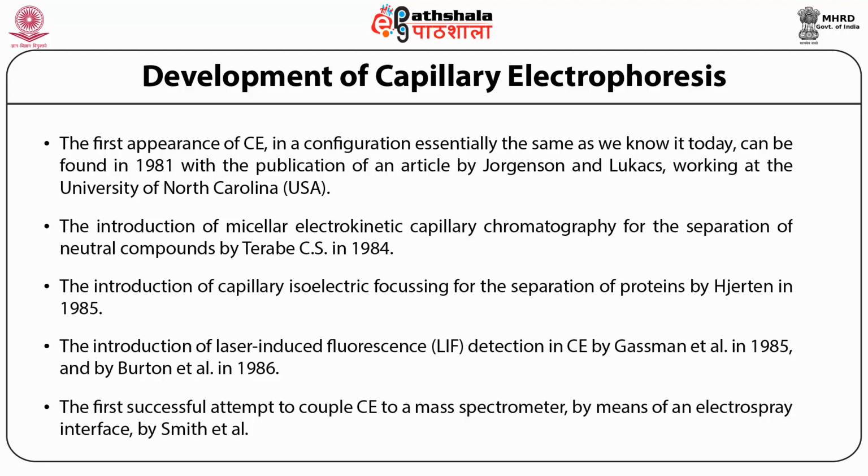Initial work in open tube electrophoresis was described by Hjertén in 1967. At that time, since only millimeter bore capillaries were available, Hjertén rotated them along their longitudinal axis to minimize the effect of convection.